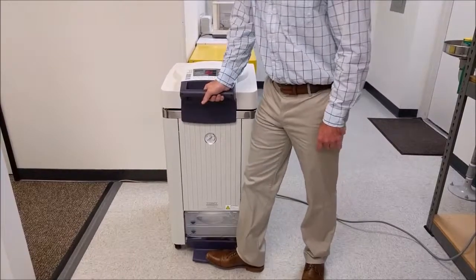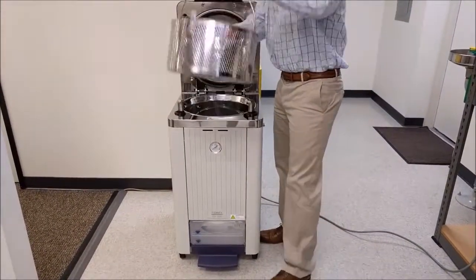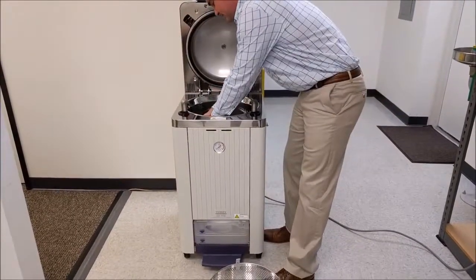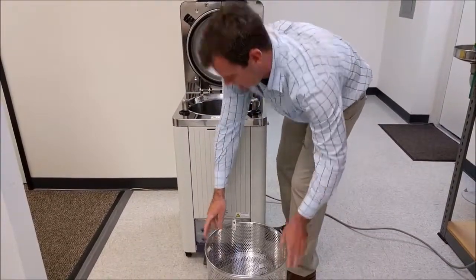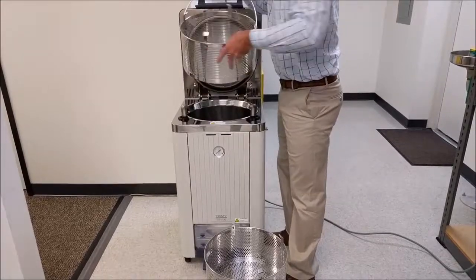This model can accept about three baskets — one, two, and here's three.